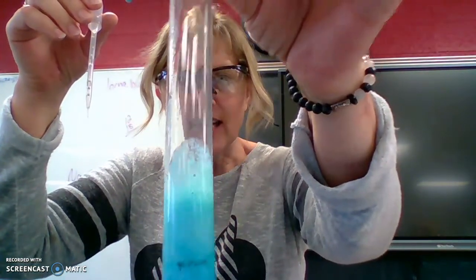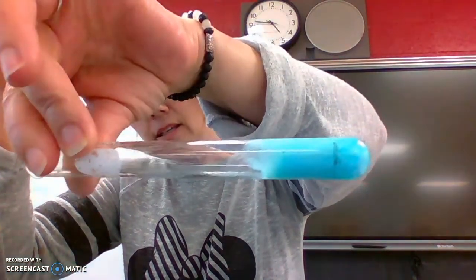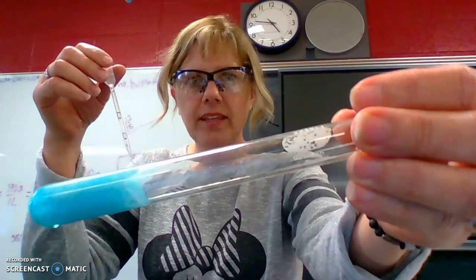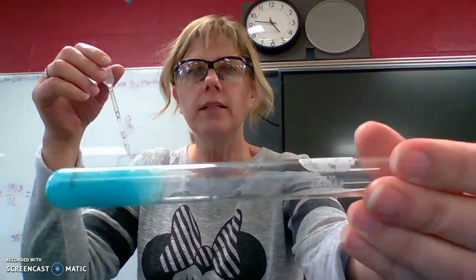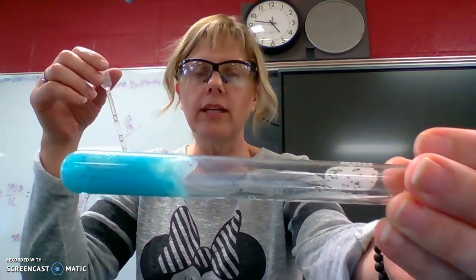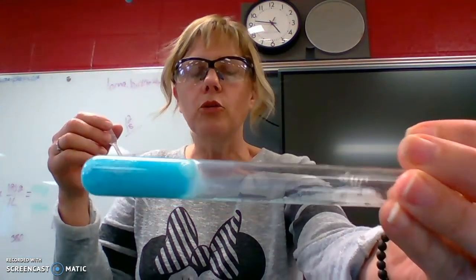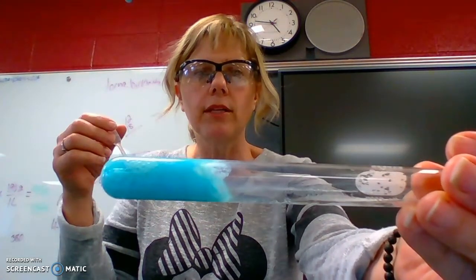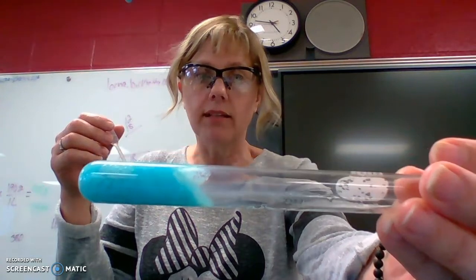But look at this. I shake. Can you see? It's like a gel. So it's this beautiful blue. It doesn't look the right color on there. It's like an aqua blue, a little green, a hint of green in it, but definitely a precipitate or solid has formed.